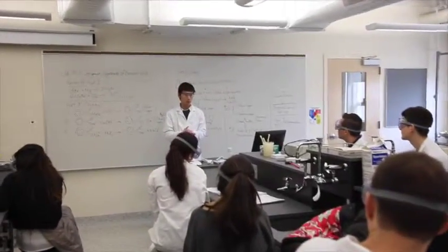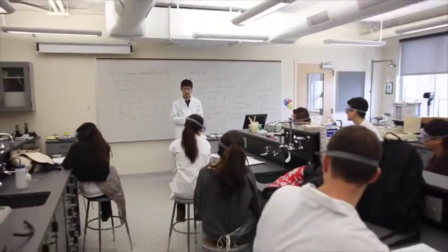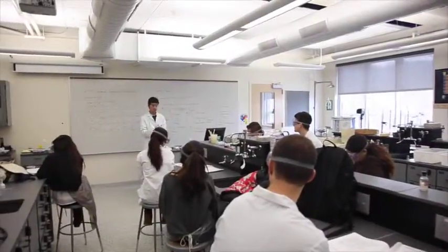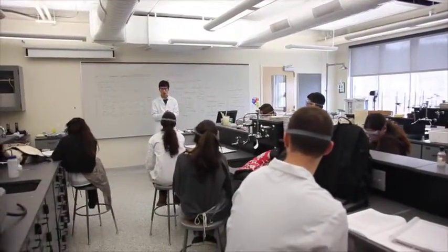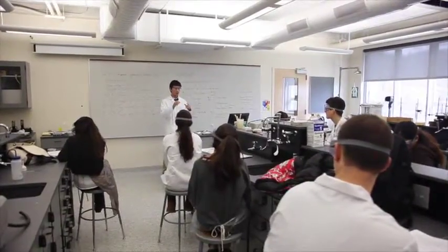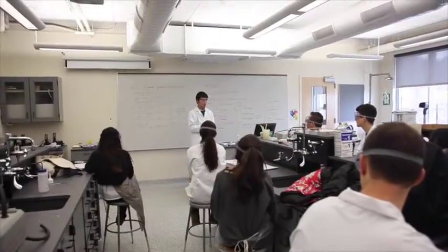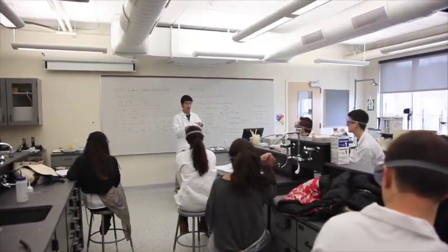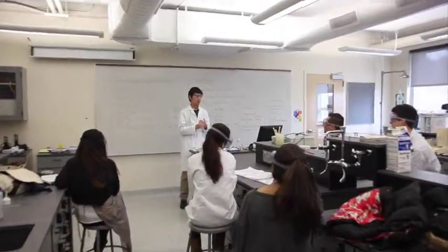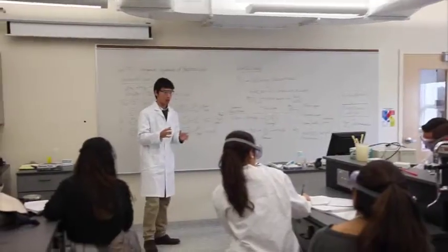Diethyl ether is a non-polar solvent. Now imagine you have diethyl ether and you also have a hydrochloric acid solution, and you form two layers, right? Which component goes to the top layer, and which component goes to the bottom layer? That's the first thing you need to ask yourself. Under this acidic condition, with pH lower than 7, when you add the acid and diethyl ether, which layer contains your product? The top one. So the top one contains your product, but you also have some side products.